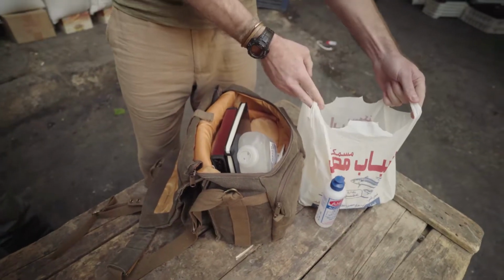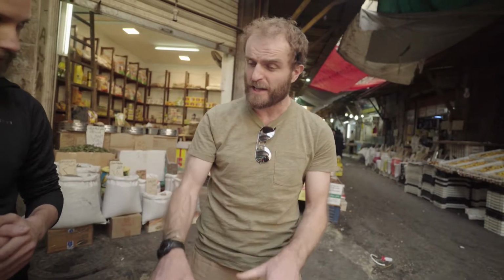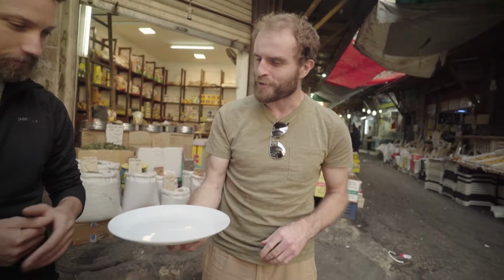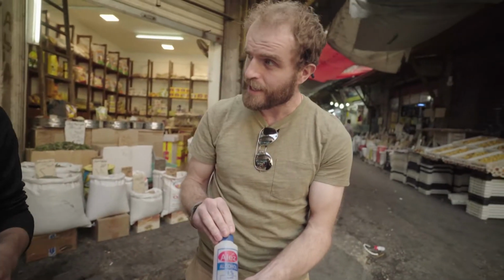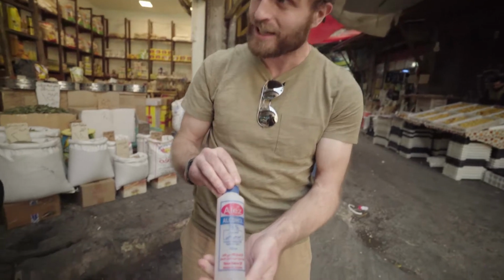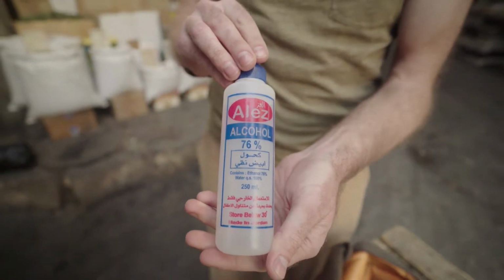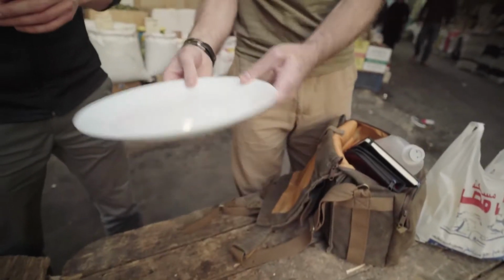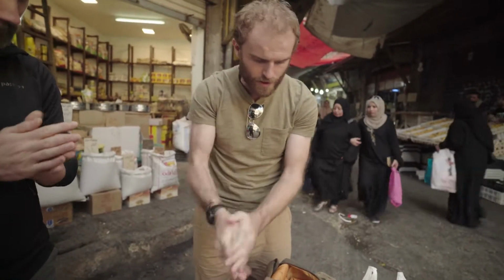First thing we need, we can't work on this wooden surface. It's nice and hard and flat and stable, but it's not clean. What I have here is something nice and clean. How convenient. We've got some 76% ethanol, 76% alcohol, and the rest is water. So that's very, very strong alcohol. That's going to kill most bacteria, most fungus, most viruses on that plate. Might even rub my hands with this too. Good idea. No harm.